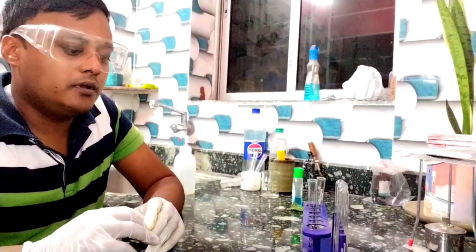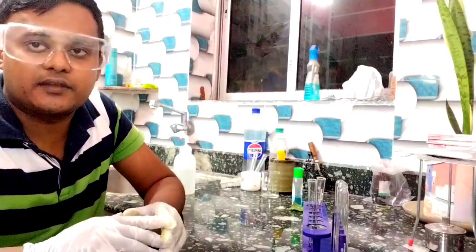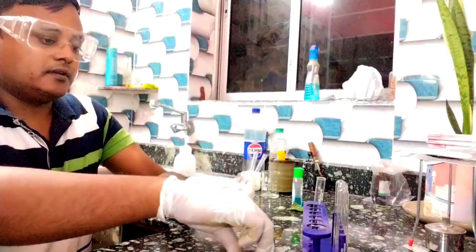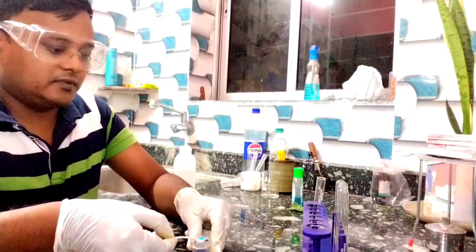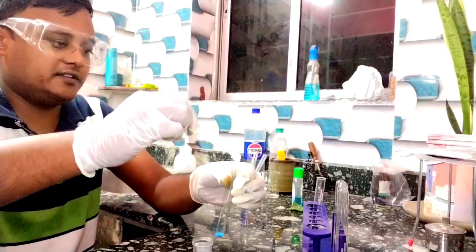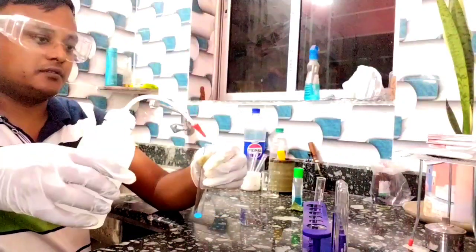Today I will show you a displacement reaction, the reaction between copper sulphate and KI, potassium iodide. First I'll prepare the CuSO4 solution. See that blue crystalline solid, CuSO4. First I'll prepare that CuSO4 solution.